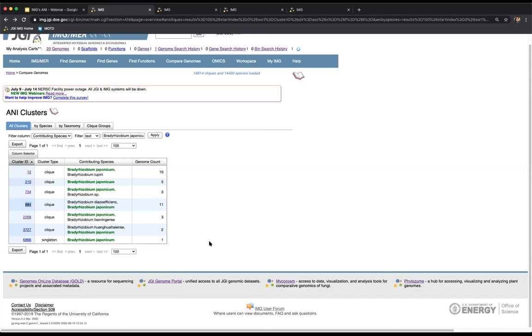Another question was how results would vary if you have MAGs. We are actually in the process of exploring that — we haven't determined what the thresholds should be for MAGs because there are many questions around completion, what is considered contamination, and what is considered a good completion level. We are currently exploring that and it's something we should be able to implement in IMG in the coming years, but we don't know the answer yet.